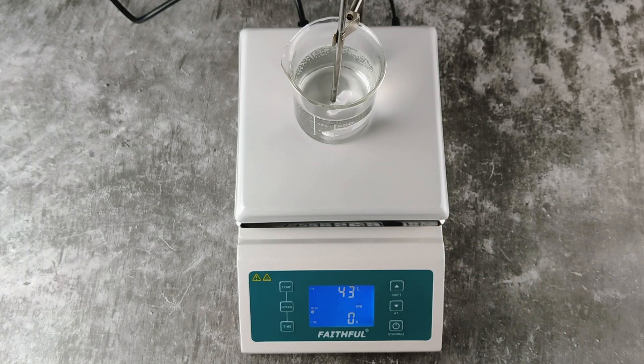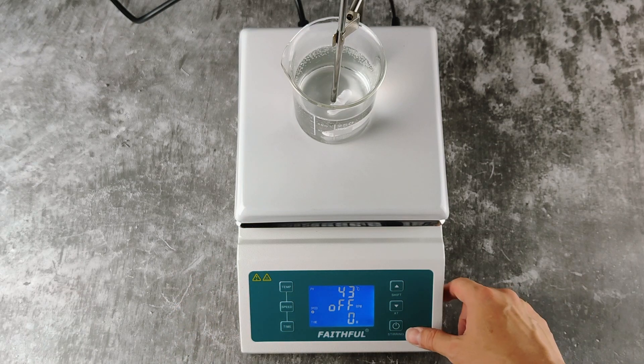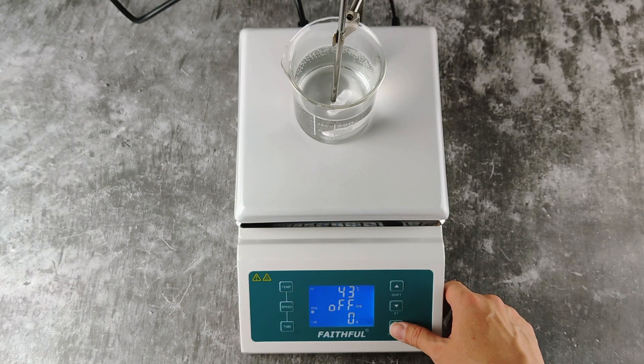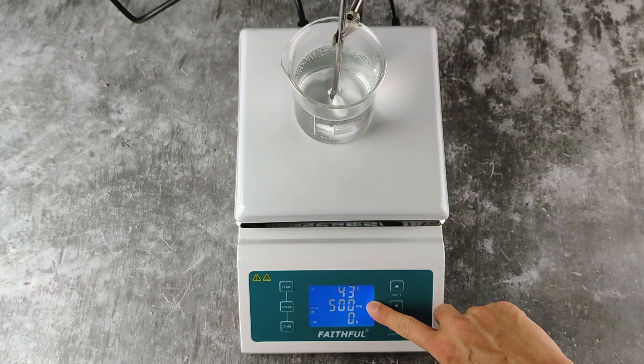After setting the speed that you want, press the speed button again to confirm this setting. And to start stirring, press the stirring button. The current speed will be displayed on the screen.